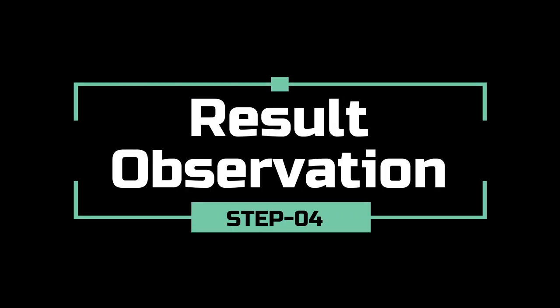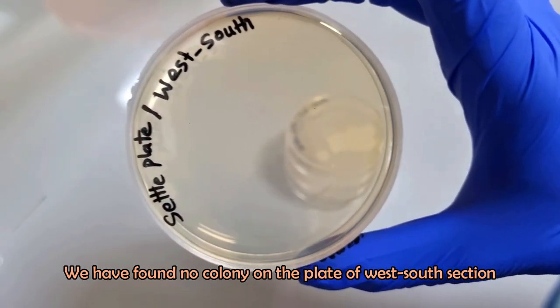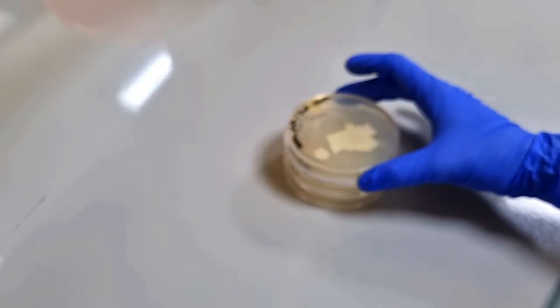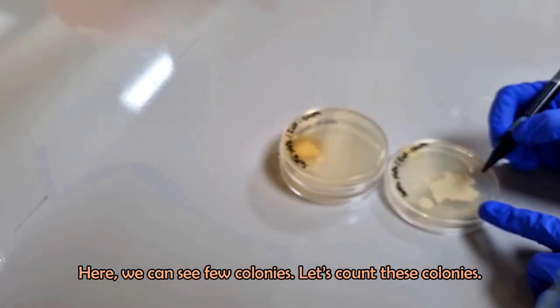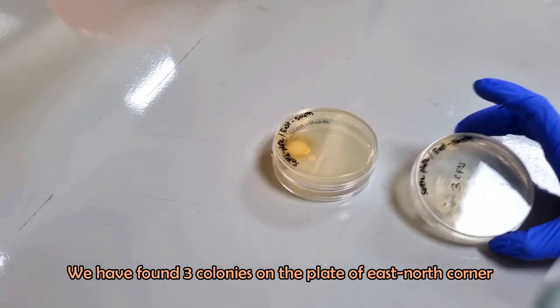After incubation, observe the plates and count the bacterial colonies if present. We have found no colony on the plate of the west-south section. Here we can see few colonies on another plate — let's count them. We have found three colonies on the plate of the east-north corner.